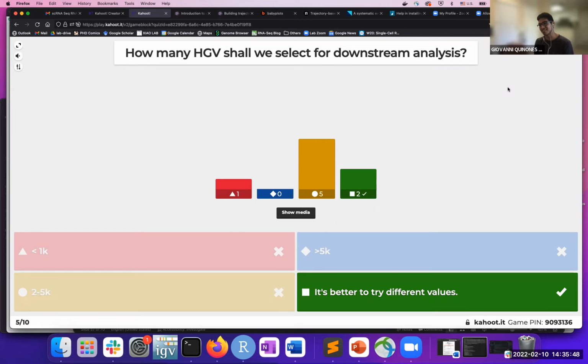And I guess to some extent, not 100% fair, because I did put in the slides that between 2,000 to 5,000 is what people select. And it's also what most people chose. However, I also made the point that it's better to try different values.